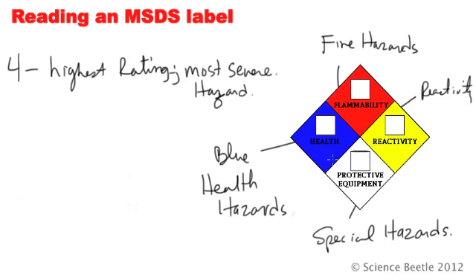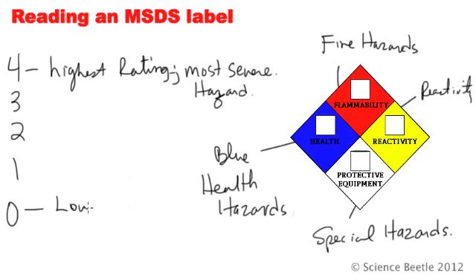When I say most severe, I'm talking about the most severe hazard for that particular color — whether it deals with a health hazard, a flammable fire hazard, a reactivity hazard, or a special hazard such as a corrosive agent, an oxidizer, acid, alkali, something that should not be mixed with water, or whether it's radioactive. The lowest rating you can get is zero. As you move up the scale from zero, the hazard severity increases.